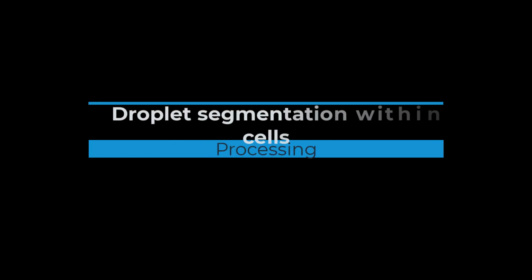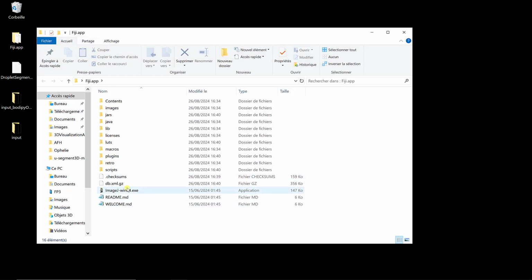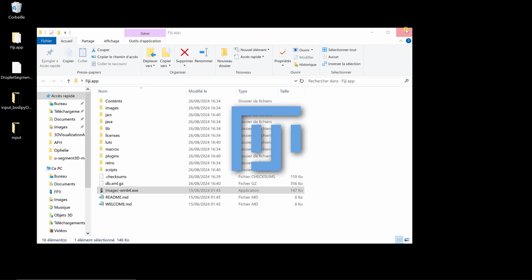In this video, I'm going to show you how to use the Fiji macro to quantify the number of droplets per cell. In the previous video, I showed you how to download Fiji and install the required plugins for this macro. Now I'm going to open Fiji again.